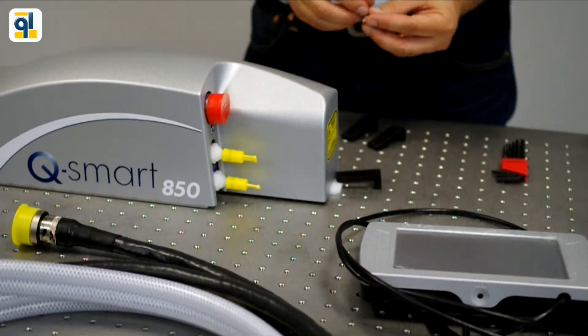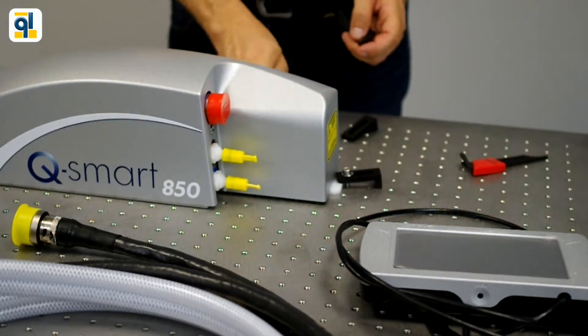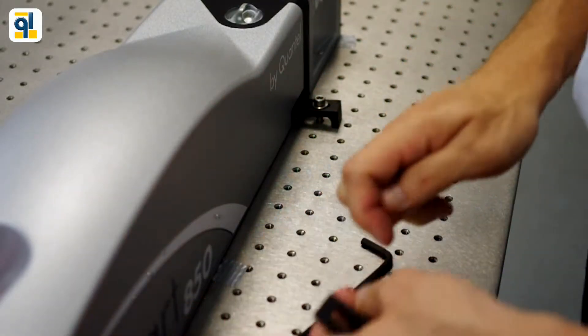The laser head mounts to the optical table secured by three mounting clamps. The setup is fast.